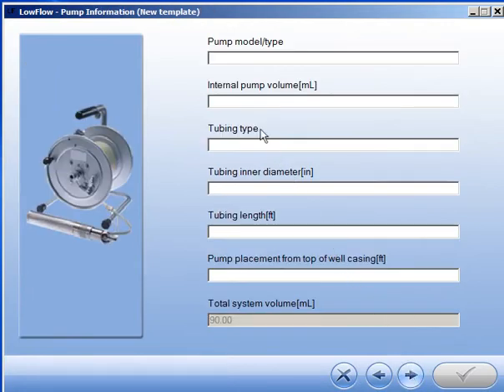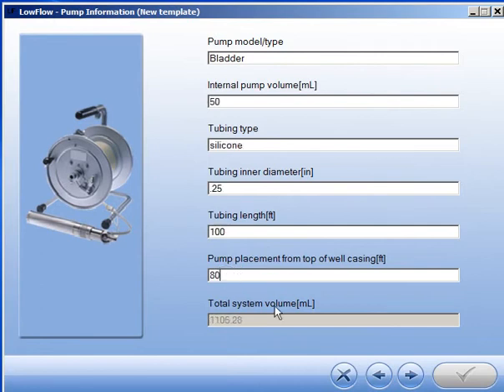Here is where you will enter pump information. The last field automatically calculates the system volume.